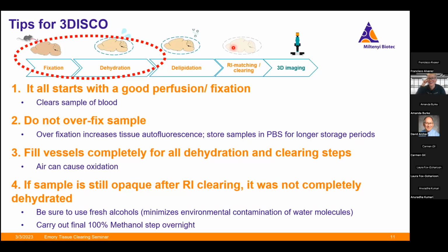I mean, it's not a lot of hands-on time, and I'll get to that when I go through the workflow. So I would absolutely recommend a chemical hood, especially for steps with the dichloromethane. That's probably the nastiest one. DBE is a toxic chemical. It's not as bad as DCM. So I have a tip a little bit later. Maybe I'm jumping ahead, but yes, I would definitely work under a hood or make sure that you have a chemical hood around for the clearing part.